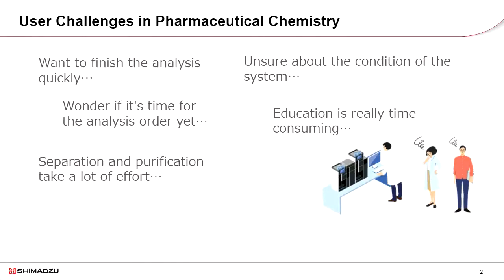I'd like to start by asking if any of you face challenges in your work similar to the questions that are written on this slide. For instance, during the verification of synthesis, there will be a large number of samples that may make it difficult to finish the analysis efficiently. Additionally, during the subsequent purification process, it can be challenging to explore the conditions for separation. Also, after purification, the desaltation and refining treatment can also be quite cumbersome. I believe that there are various challenges and issues depending on the specific circumstances in your field.